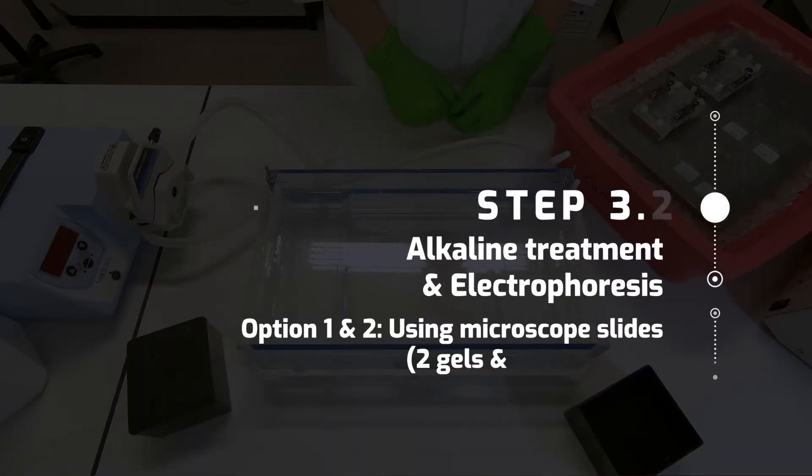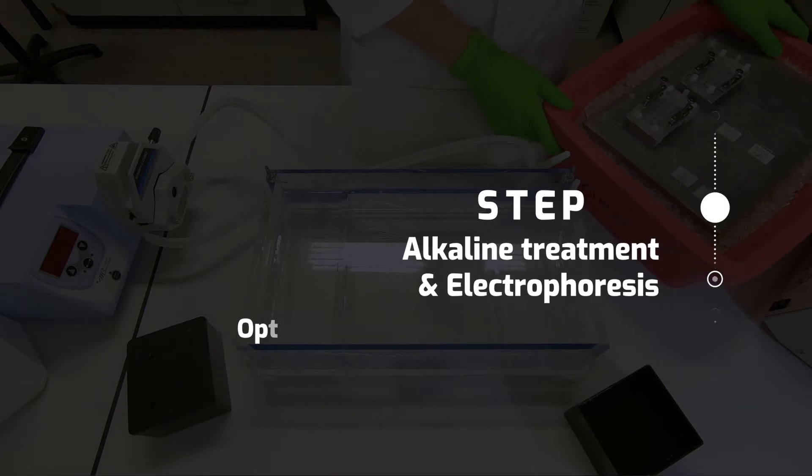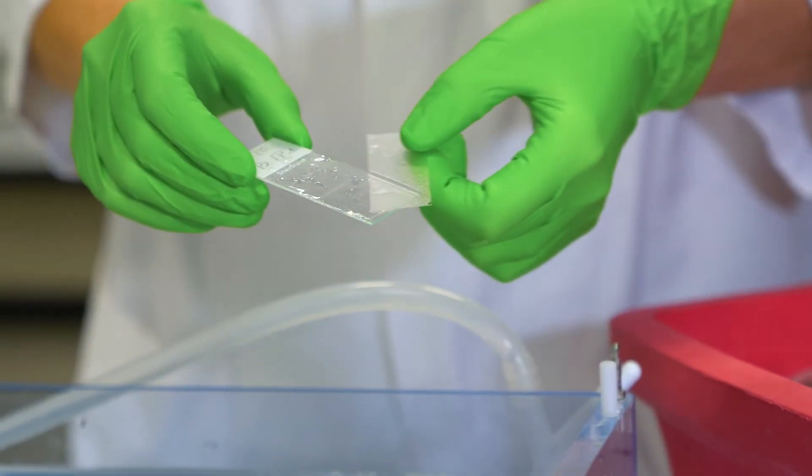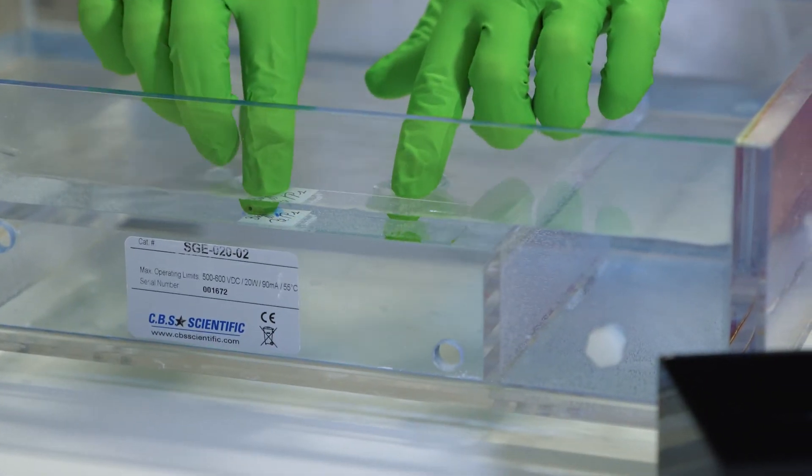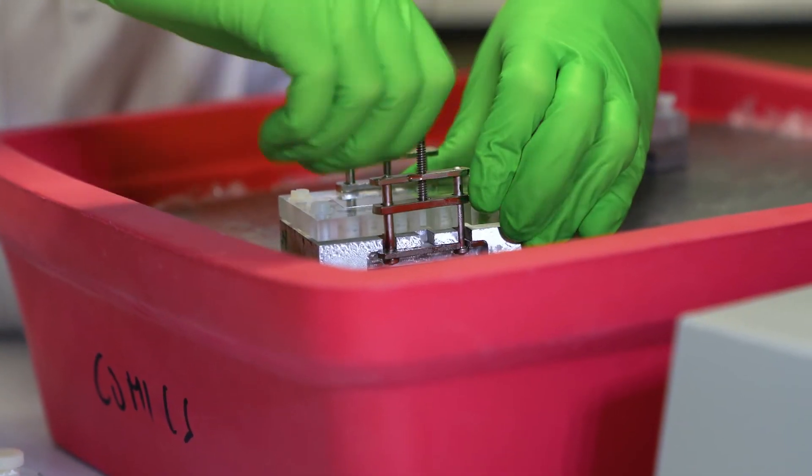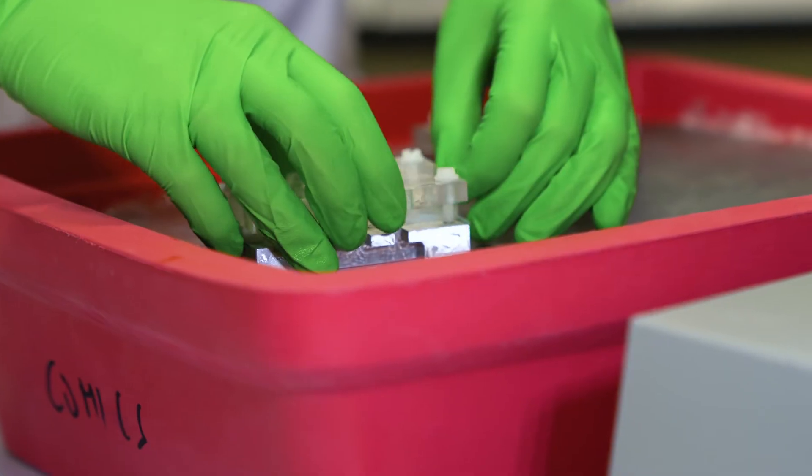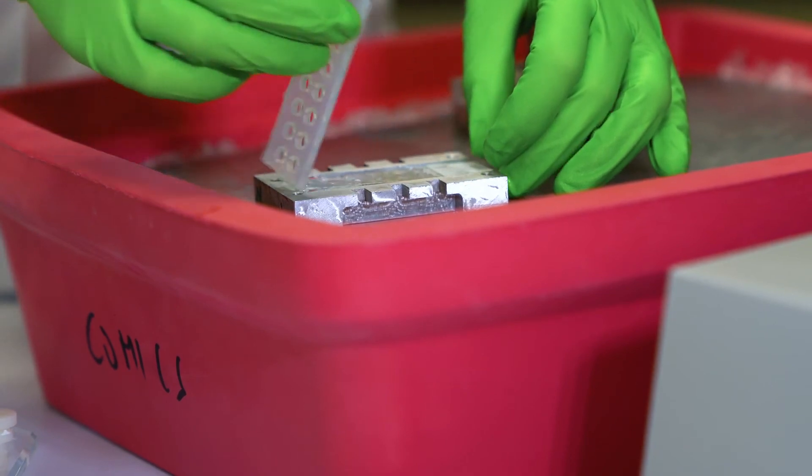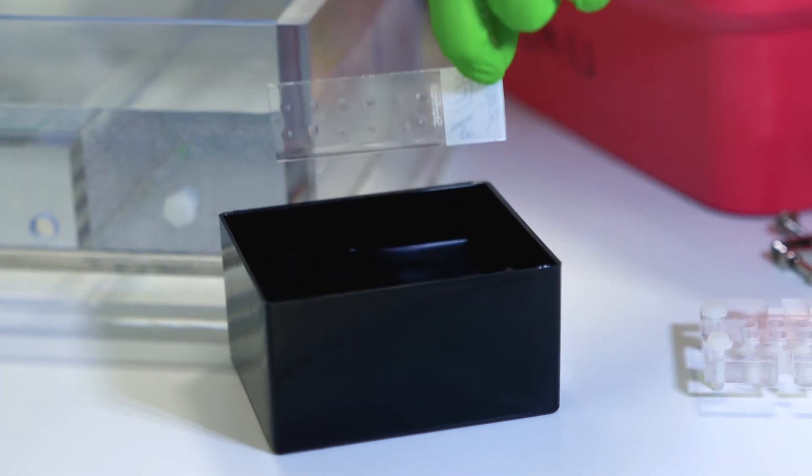After incubation, slides, all the slides, including the 12 gel units, are placed on a metal cold plate. Remove the cover slip of the slides containing 2 gels and transfer them to the electrophoresis tank. In the case of the slides containing 12 mini gels, remove them carefully from the 12th unit. And quickly, immerse them in an electrophoresis buffer before transferring them to the tank.